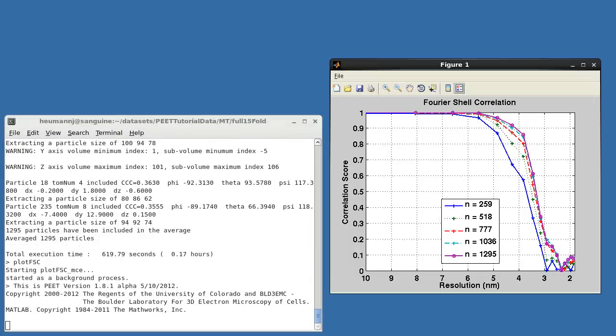Symmetrization such as this is, of course, not applicable in all cases. You may well wonder if something more general can't be done to reduce missing wedge artifacts and speed up the initial alignment search for both helical and non-helical microtubules. Indeed, it can. Recall that in this dataset, the individual protofilaments were visible and could be traced along the surface of the microtubule. We can exploit this information to determine the microtubule twist, and to generate initial motive lists using a program called modTwistToEM.